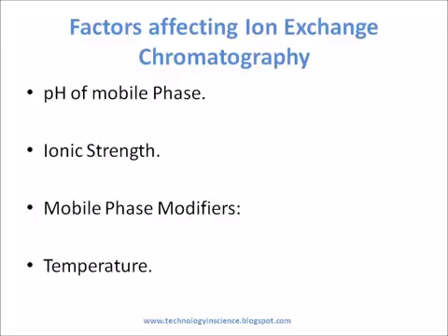Factors affecting ion exchange chromatography. The following factors have effect on the separation efficiency and resolution: pH of the mobile phase, ionic strength, mobile phase modifiers, temperature.